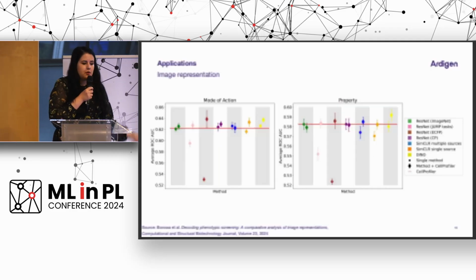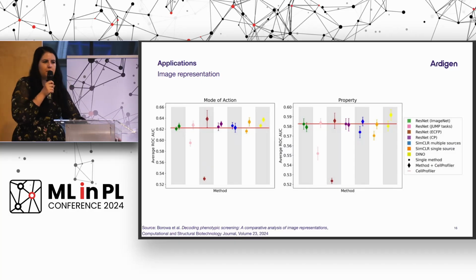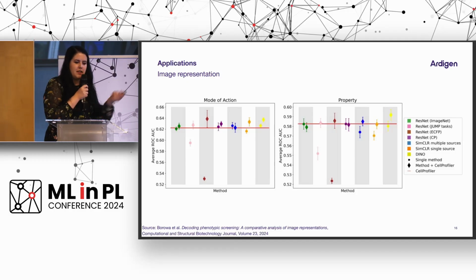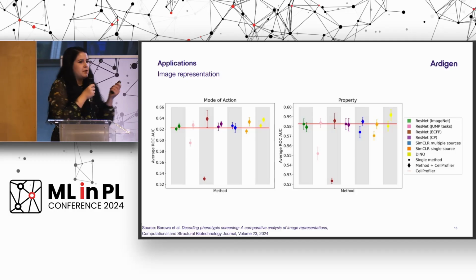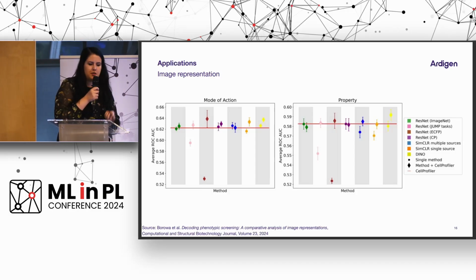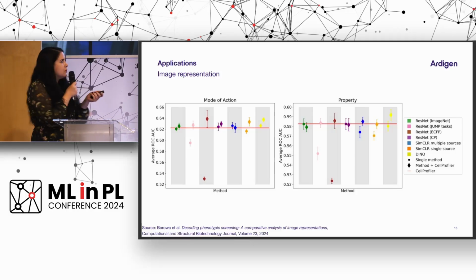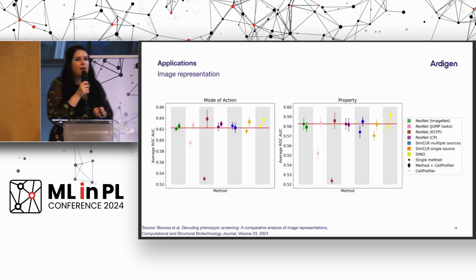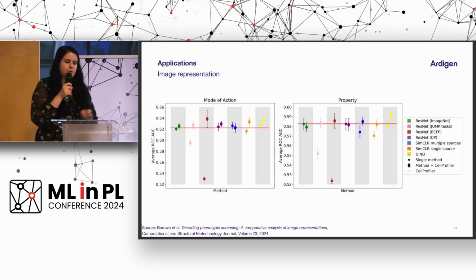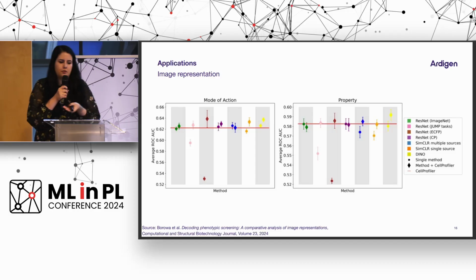Examples of how this representation can be trained are basically whatever was in the research for natural images. We can have CNNs like ResNet trained for different tasks, and then we test if that representation is working well enough. We can also go into contrastive approaches like SimCLR, and with the JUMP-CP dataset it's easy enough because we have enough examples to pull those positive examples for contrastive learning.